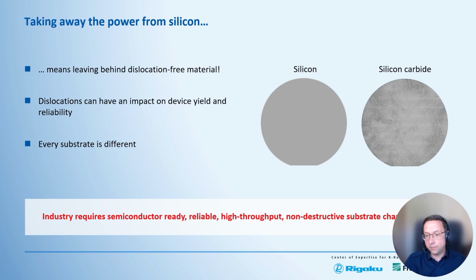That requires, from the industry point of view, a characterization technique which is on the one hand semiconductor ready, which means it is applicable in semiconductor cleanroom fabs. It delivers reliable data with a high throughput and is of course non-destructive.